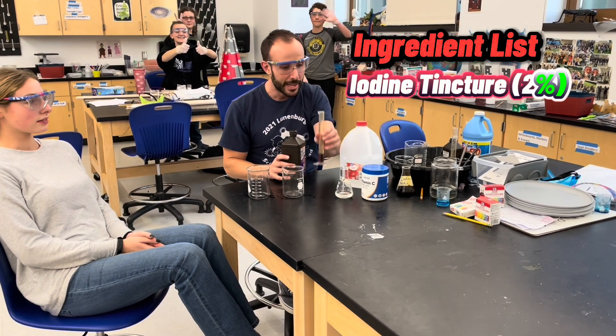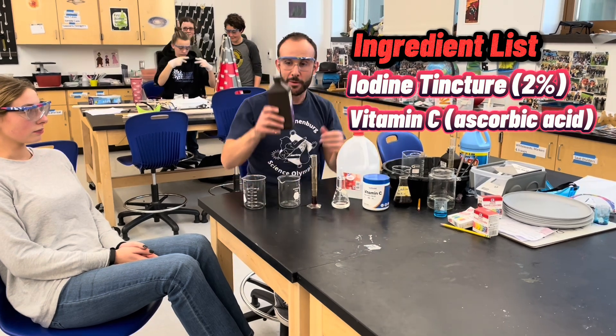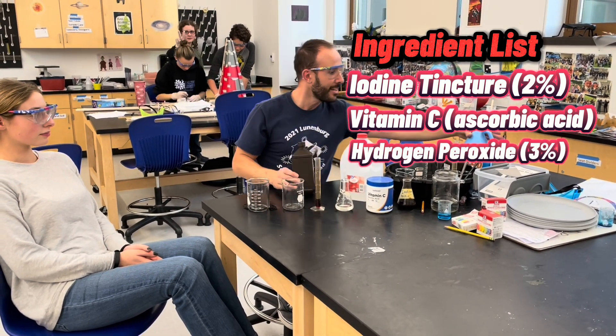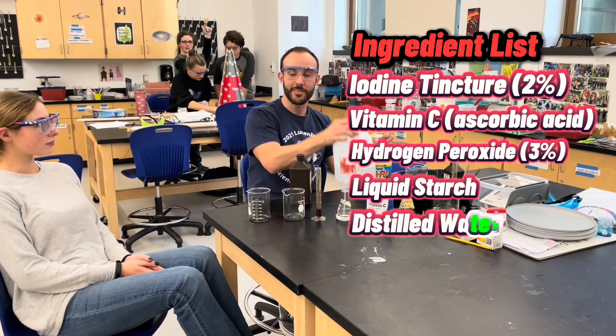We need some iodine, we need some vitamin C, which is ascorbic acid, and we need some hydrogen peroxide, some liquid starch, and distilled water. That's all we need.